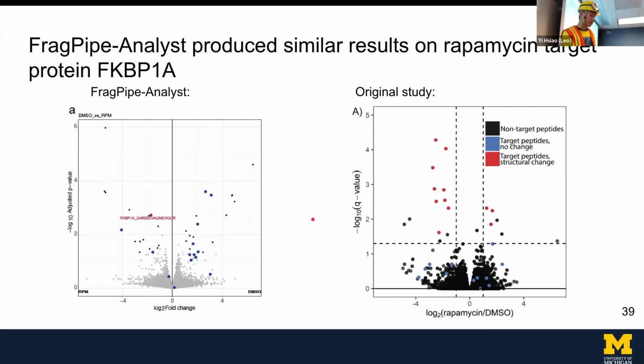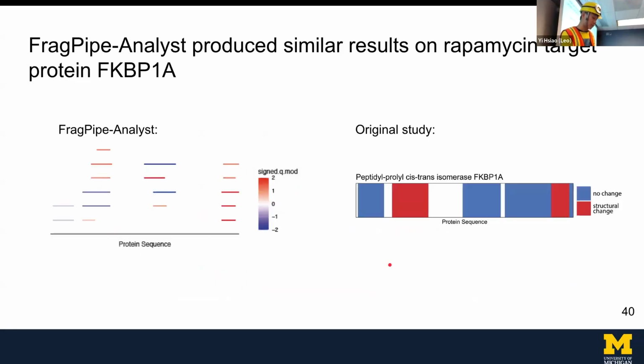One thing we want to improve is this: you might be interested in one peptide since it is upregulated, but you want to see how much change is introduced in other peptides that come from the same protein, since they are the same protein target. So we made this functionality intuitive. You click one peptide feature, and it will highlight other features that come from the same protein together, kind of replicating the analysis they performed in the original manuscript.